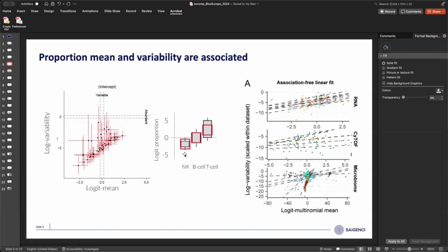Why are there bimodals? Like, what are those outlier bimodal things? Yeah, so those are rarer cell types. Because they're not shown in, for example, cytof. So they might come from the fact that you don't have a lot of information for some cell types.